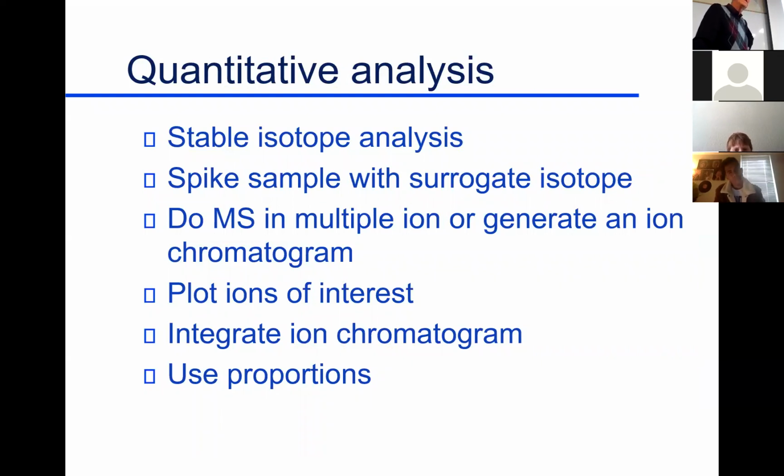So that's one technique, looking for identification. That's one of the major jobs. But it's also really good for quantitative analysis, how much of something happens to be here. In some cases, we want to get an accurate measurement of a compound. Again, I might be looking for some flavor compound or some off-flavor compound. So if I want a really good quantification, I will spike my sample with an internal standard. Now that's where the fun begins, because how do you choose an internal standard for your analysis?